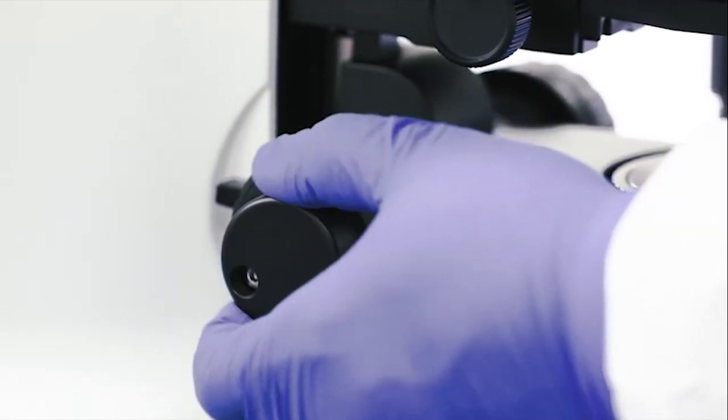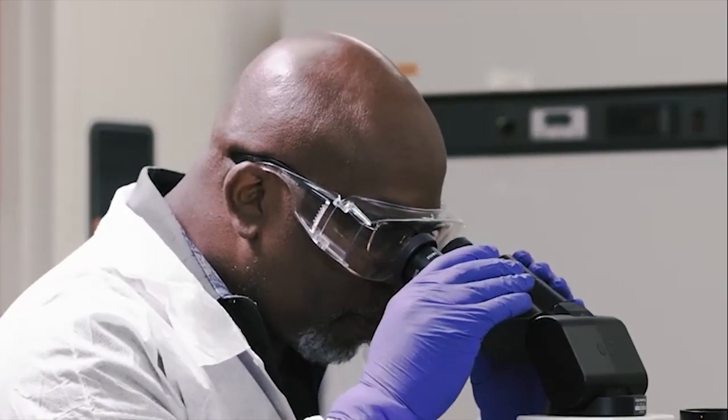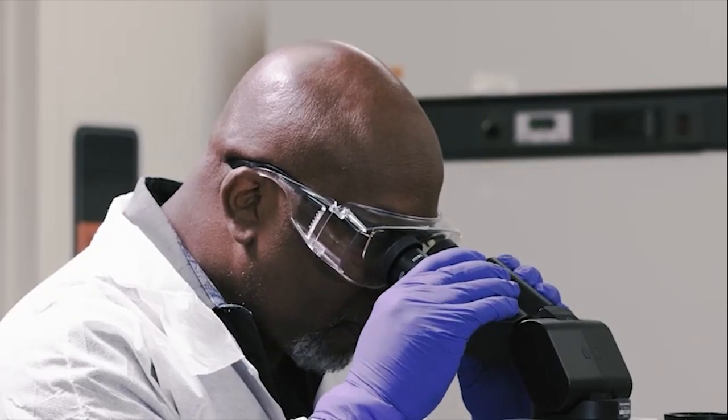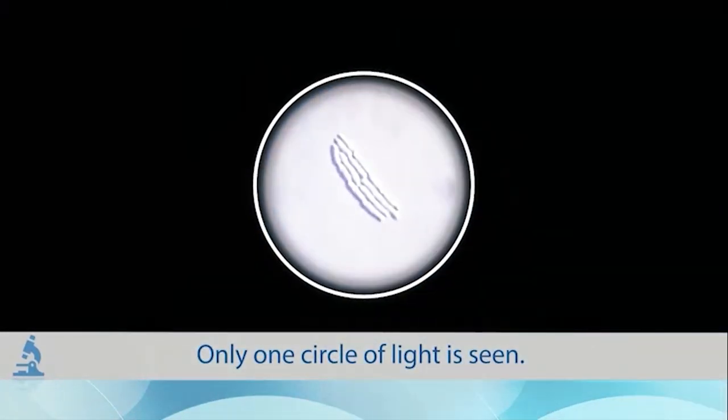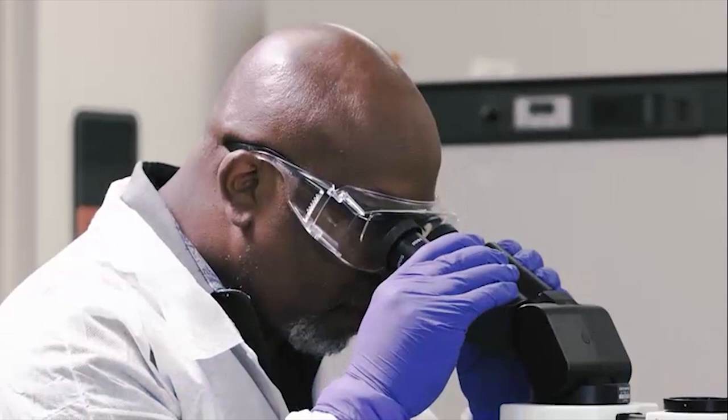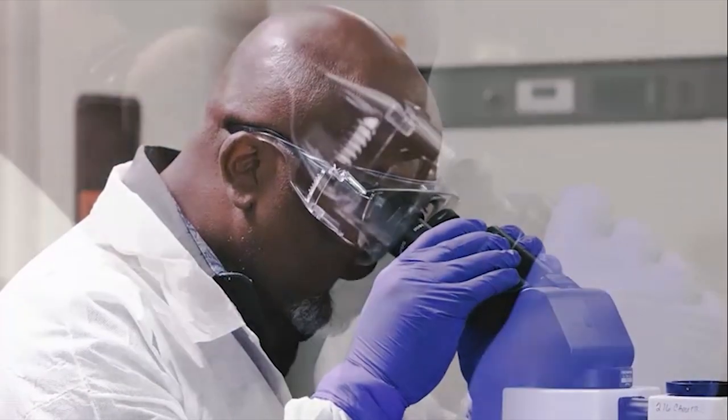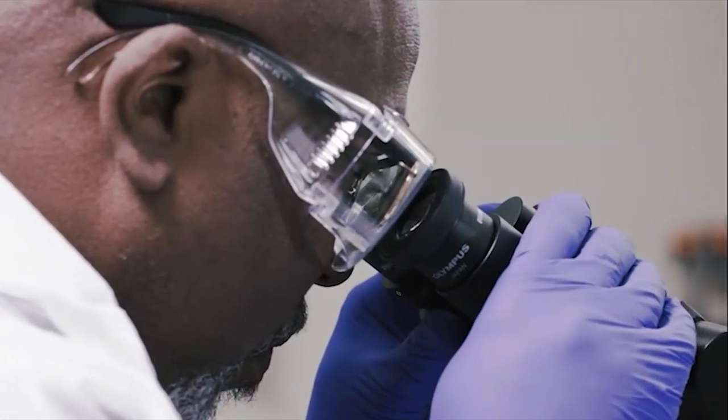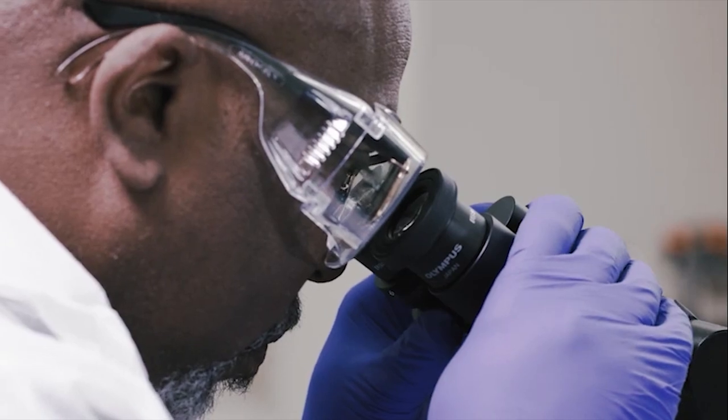Adjust the oculars for interpupillary distance so when looking with both eyes only one circle of light is seen. This should be done for the particular individual reading since the interpupillary distance can vary from person to person.